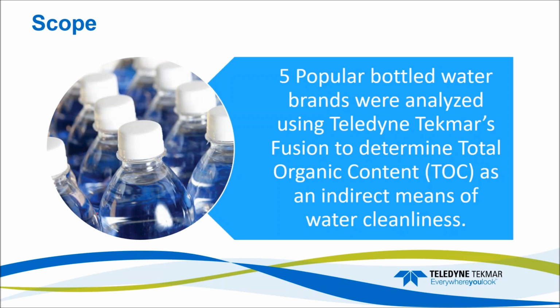So the scope of the study was five popular bottled water brands analyzed using Teledyne Tekmar's Fusion to determine TOC content as an indirect means of water cleanliness.